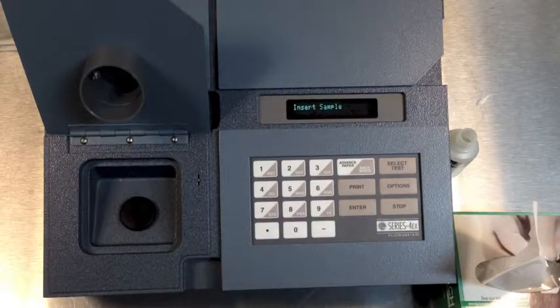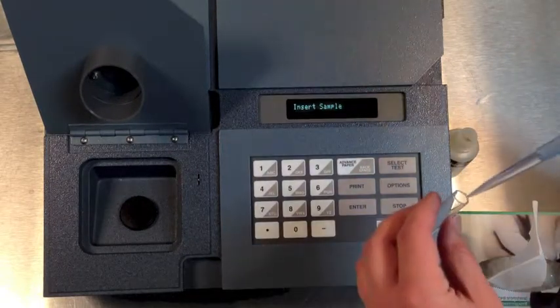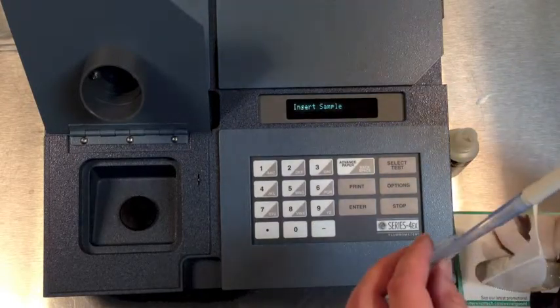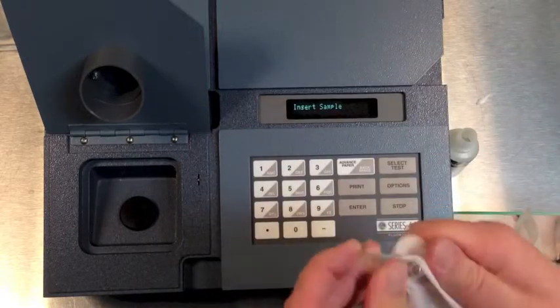Next, test our okra test elution solution. With a pipette, put 1.5 milliliters of solution directly into a clean cuvette. Insert into the machine, run the test, and confirm that the result is zero.